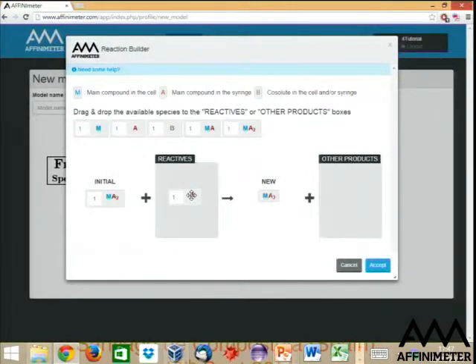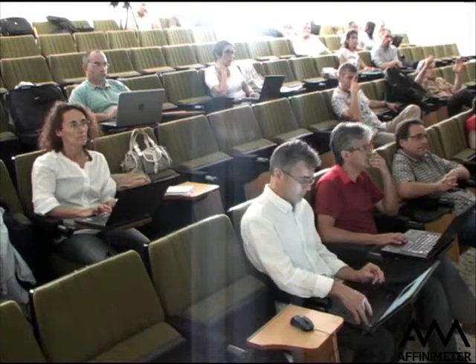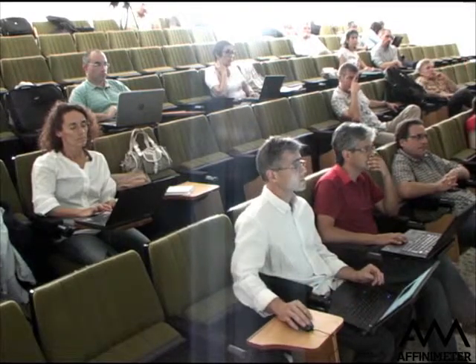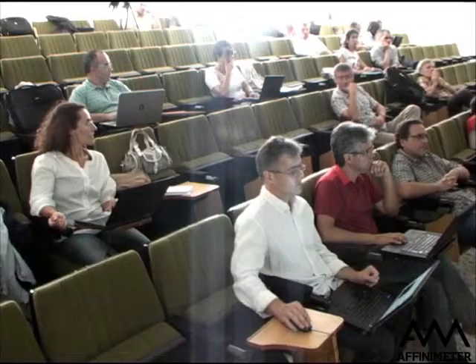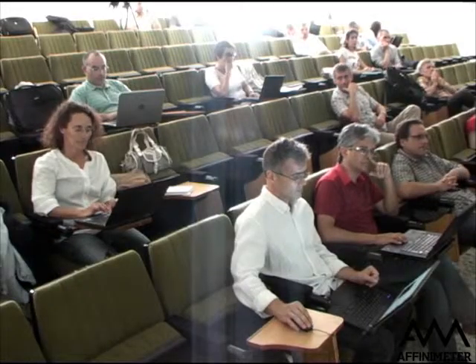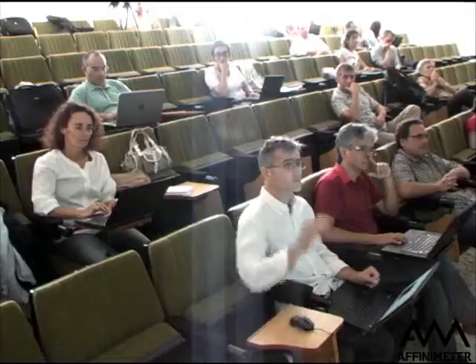What is the meaning of the orientation of the arrow? It's just, well, it's for fun, and if you have many equilibria, you might want to order the equilibria somehow in a way that you have a better view of what's going on. So that's the only reason. So now we have complex MA3.